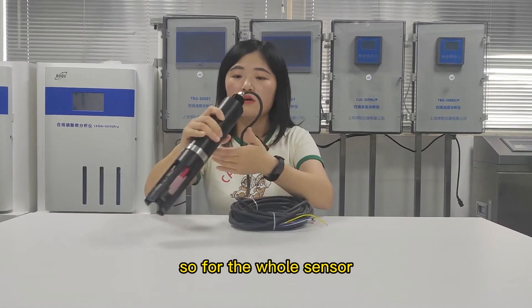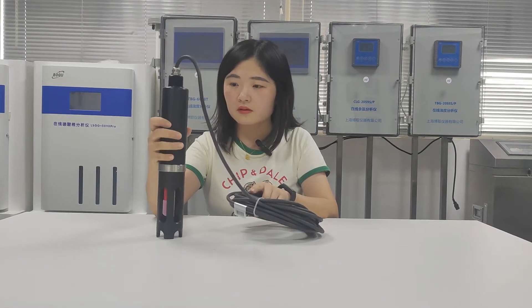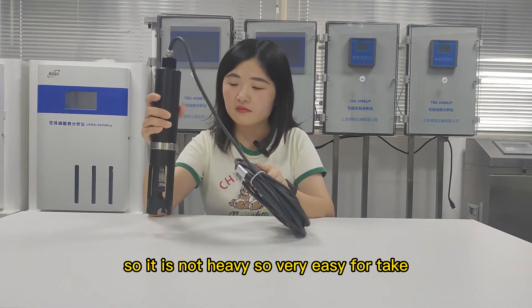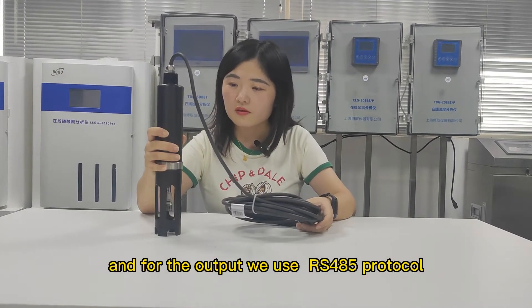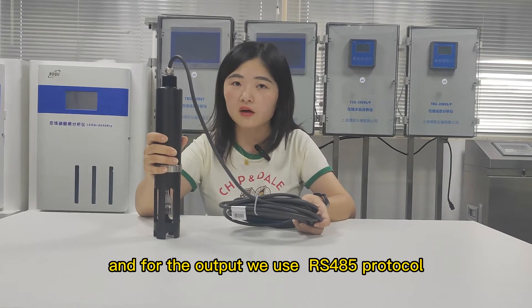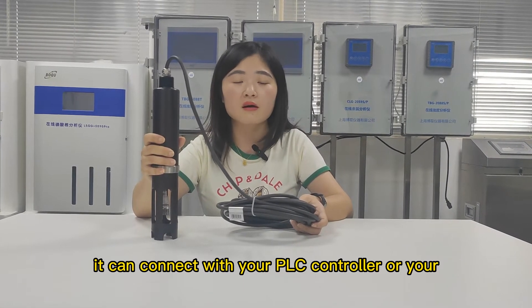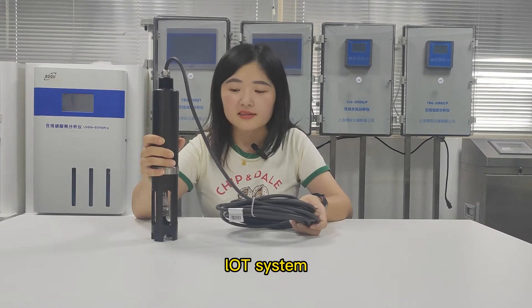For the whole sensor, it is made of POM material, so it is not heavy and very easy to handle. For the output, we use the RS485 protocol, so it can connect with your PLC controller or your IoT system.